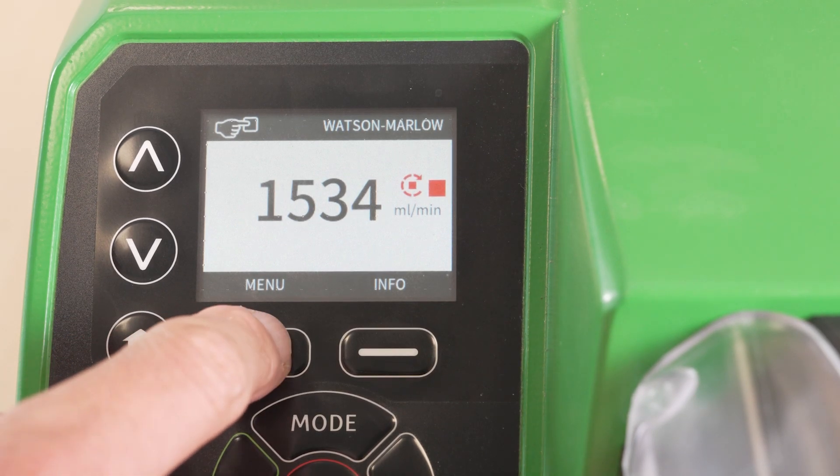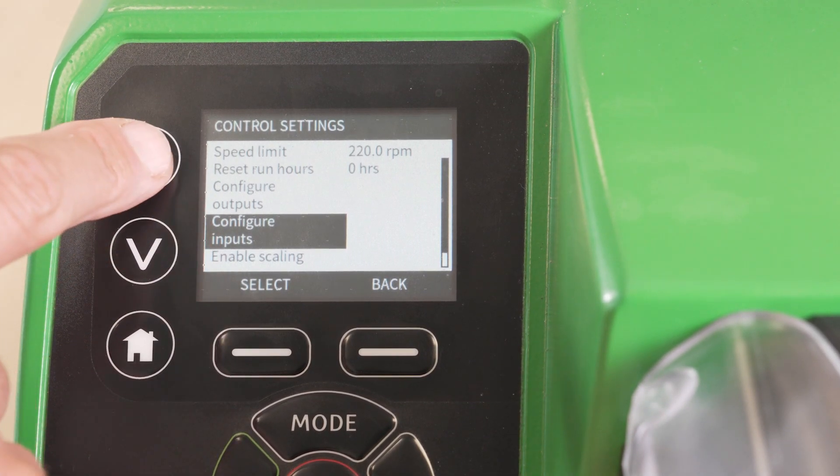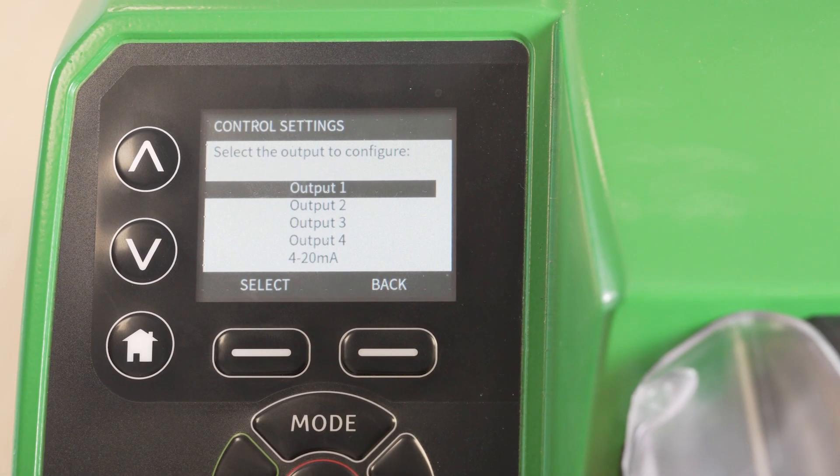To configure the digital outputs, select menu. Select control settings. Navigate to configure outputs and select. There are four digital outputs which relate to the four output relays on the end module.